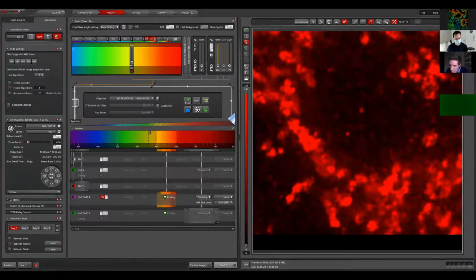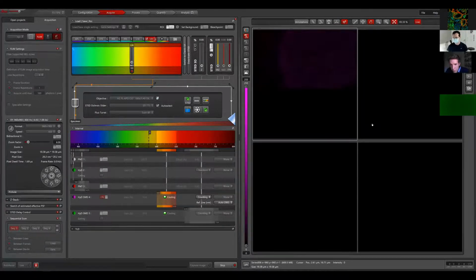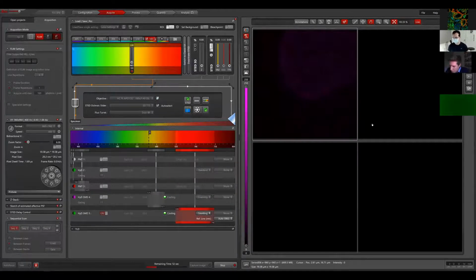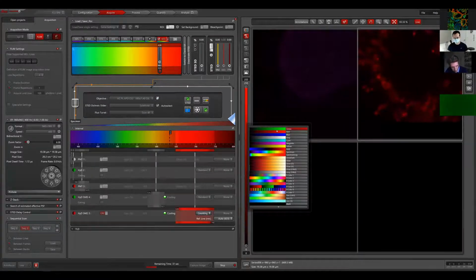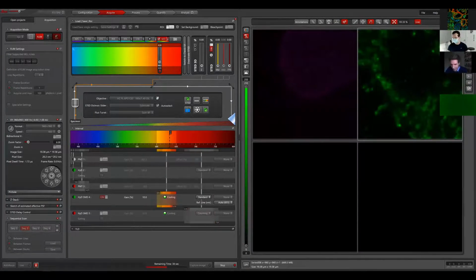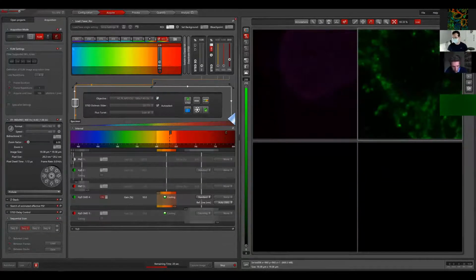But as there are so many more questions, let's have a look at the second one. There is actually quite a bit of discussion about exactly that question. So can you give a short hint on where to do that? How to disable the option? From the top of my head, it's just a right mouse click inside the Navigator window, and then you have a couple of options popping up there. And the right option would be which one? I don't know how it's called exactly, but you can find it in there. That's what I can say from the top of my head without sitting in front of a system right now. But I can come up with the exact name.